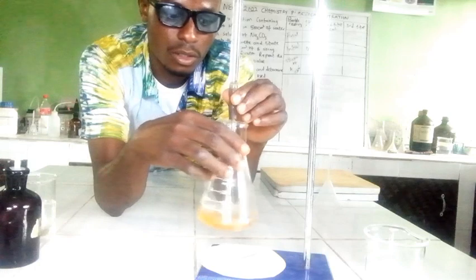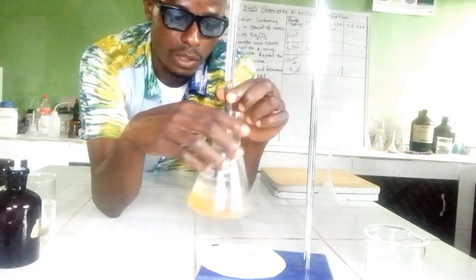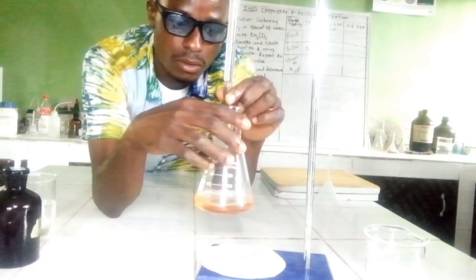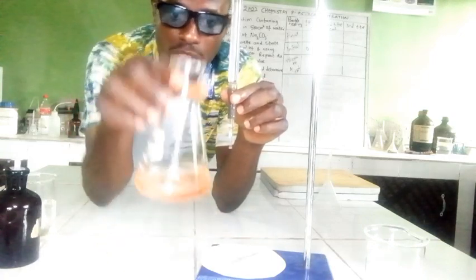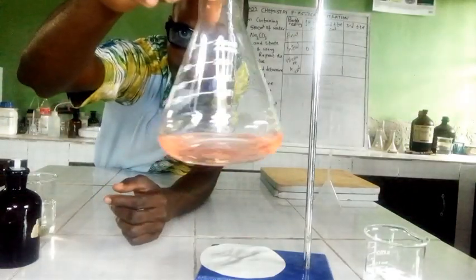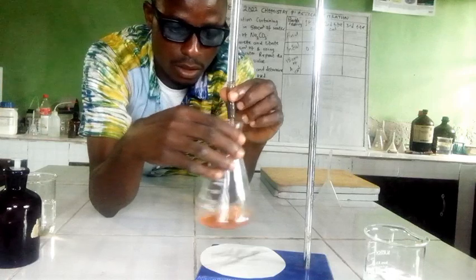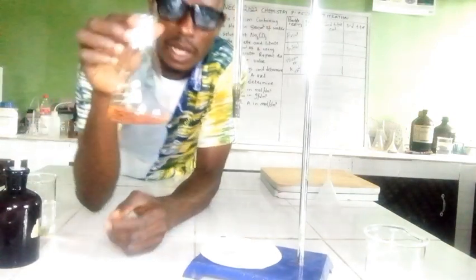You have to be very careful at the first titration so that you can easily detect any color change. Okay, I think the color has changed. Still remaining a bit. From yellow, it has actually changed to... We have seen the color change now. So I can see it very well here.